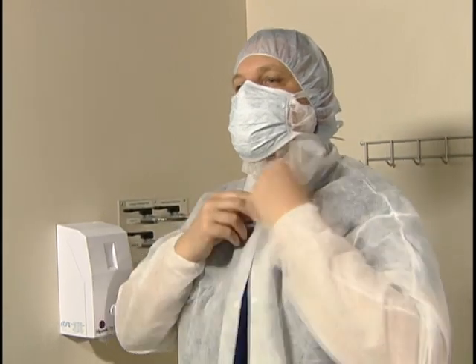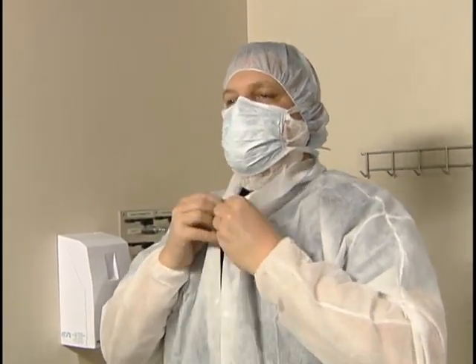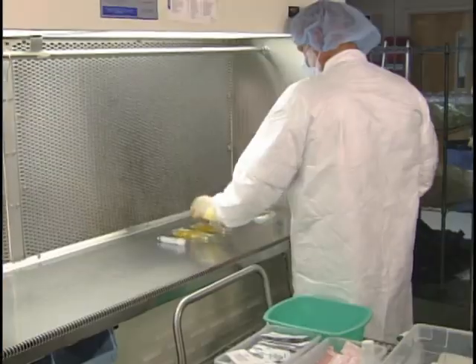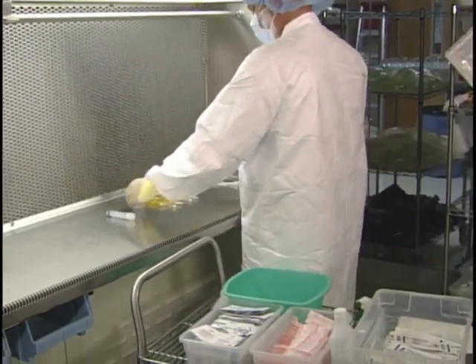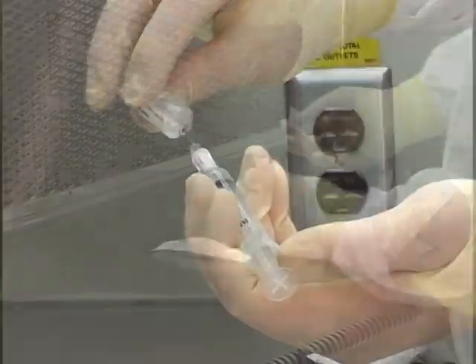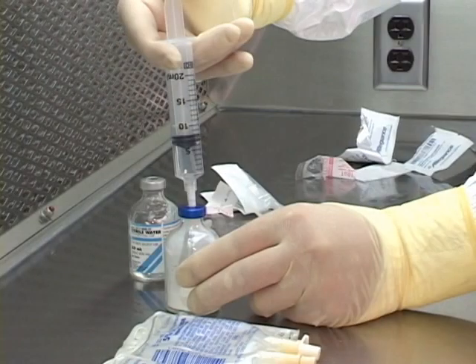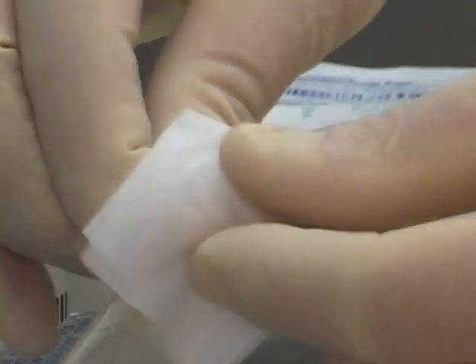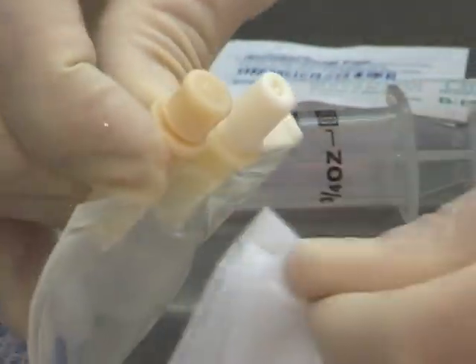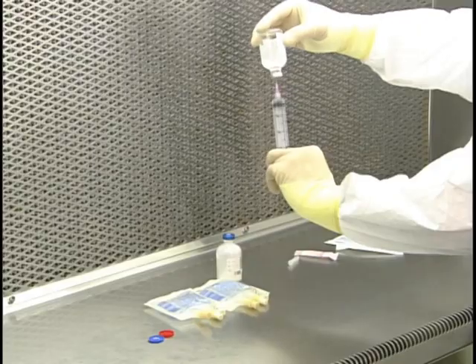After gowning up in proper cleanroom attire, you will retrieve a bin at the setup counter and proceed directly to a laminar flow hood workstation. To keep the items used for compounding as sterile as possible, you should not leave the workstation until the batching process is completed. With careful estimation, the Minibag Plus and Advantage IVs can be prepared in batches.